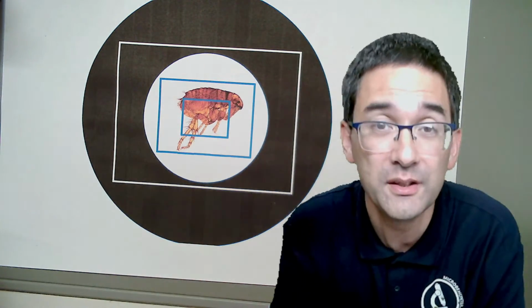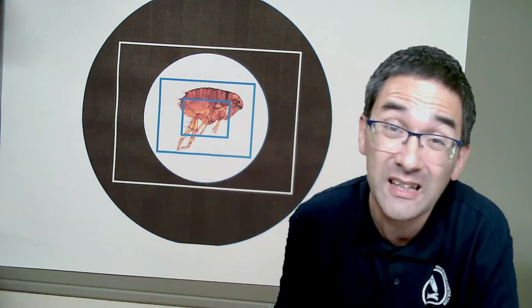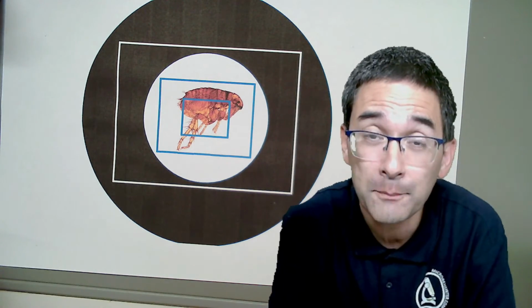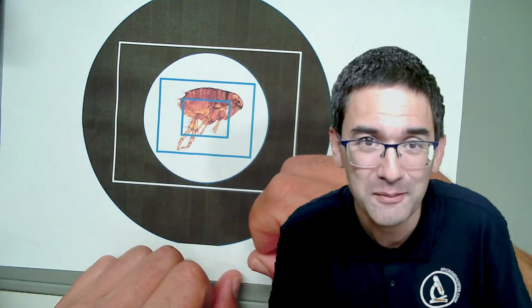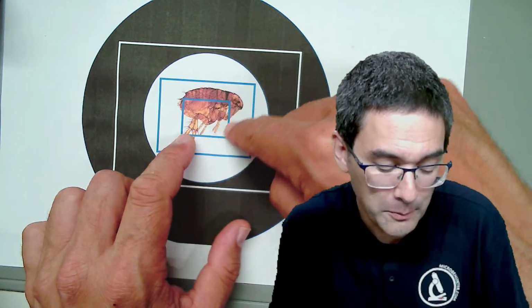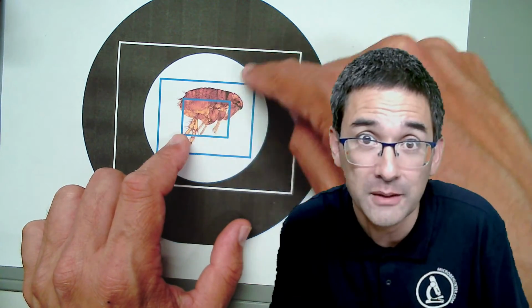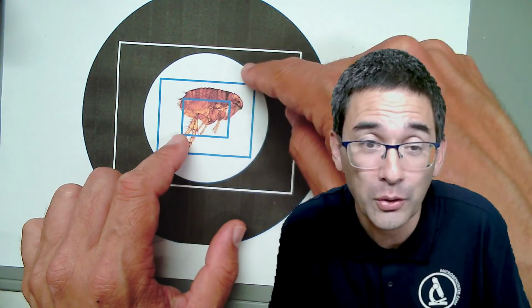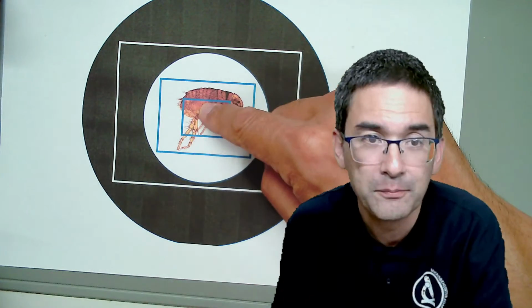Now, some people are going to say, well, isn't this great? Because when you make it larger, you get additional magnification. And I'm saying, nah, it's not always better, because sometimes it becomes more fuzzy and more blurry because you're above the resolution limit. That's one problem. The second problem, especially with moving objects, is that it's very difficult to catch them sometimes if certain organisms start to pass through, because you're just looking at a very small part in the center.